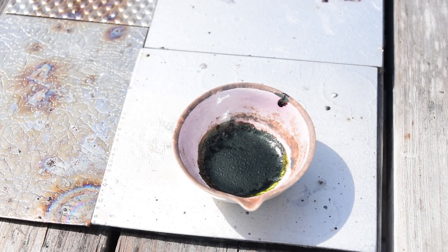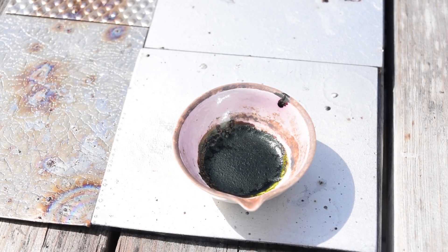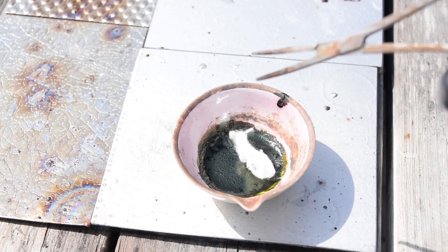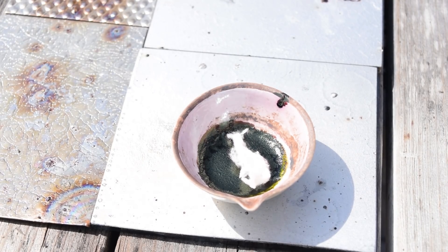Now let's try some poorly nitrated nitrocellulose. It's good to go. It just doesn't want to work — it just doesn't want to work.